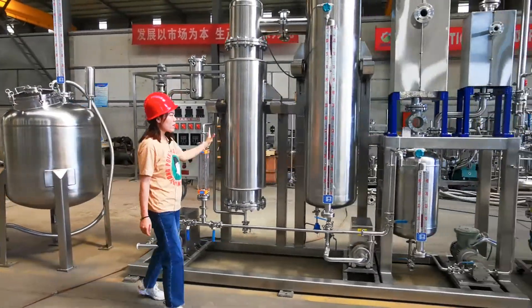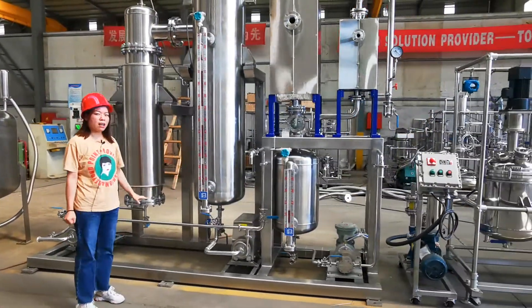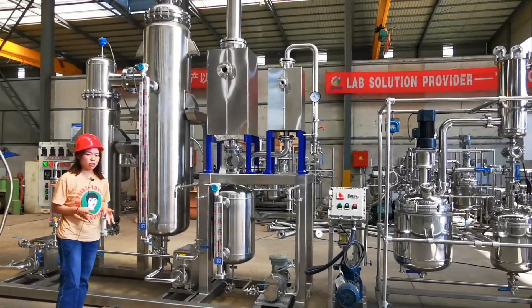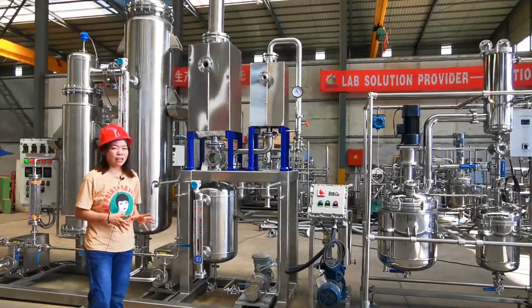This is our rising film evaporator for ethanol recovery, and it has a very high recovery rate and very high efficiency.